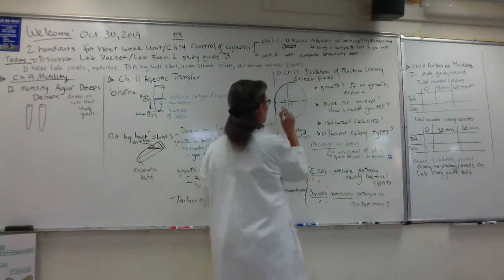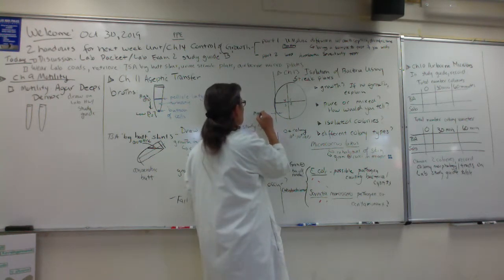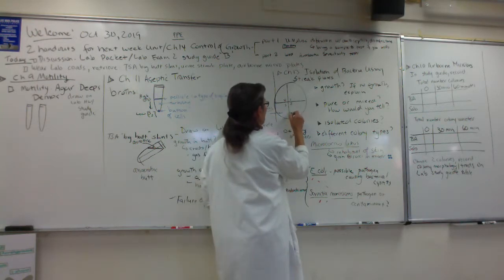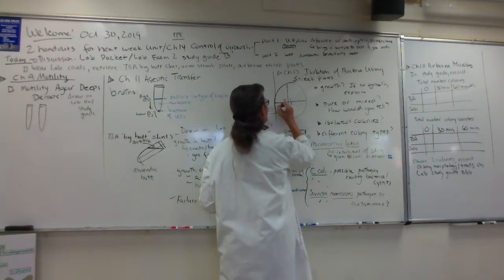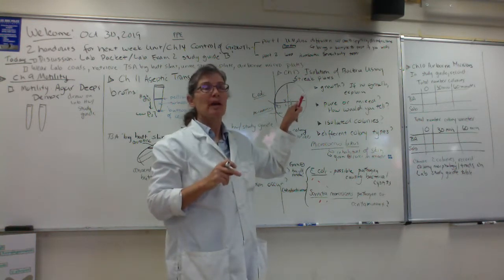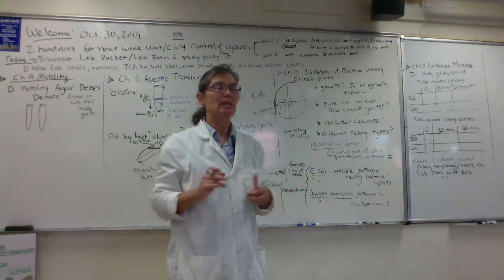So you guys, what if, let's say, I'm just going to pretend, you guys, let's say these little guys are the Micrococcus. Those little tiny colonies. I don't have yellow ink, right? And you're not thinking, I don't think that's a pathogen, but those great big colonies, you guys, the great big non-pigmented, that's an E. coli. How can you get your potential pathogen, your E. coli, into pure culture and pretend you got lots of TSA plates?